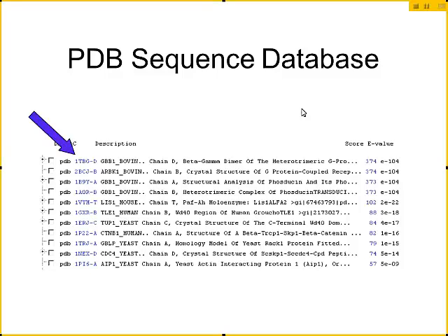That's an experimental structure. You'll notice that all of these accession IDs tend to have a fifth alpha character associated with them. That is what's known as a chain name. If within your structure it is a complex of more than one polymer chain — a homodimer, heterotrimer, or heterohexamer — each of those different polymer chains has a unique identifier called a chain name. So when you see a dash fifth character, that is the chain name, meaning I share sequence similarity with only one of the chains in the structure.